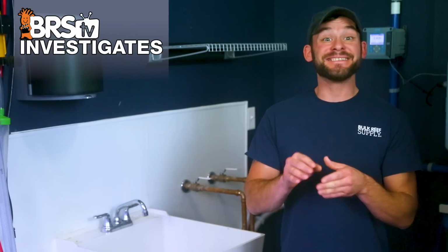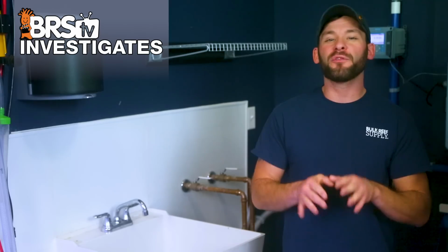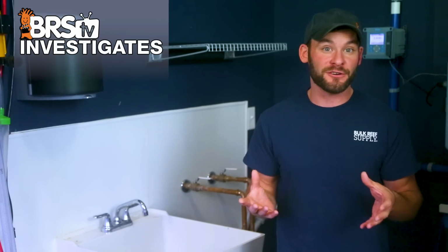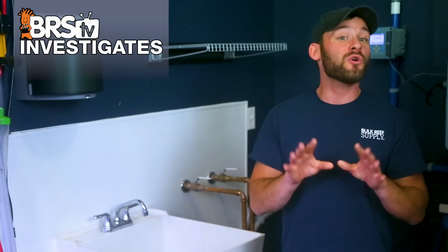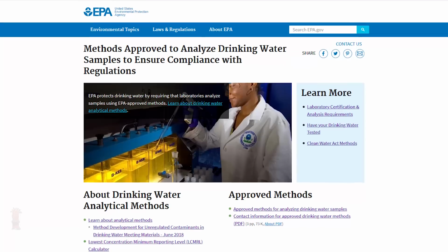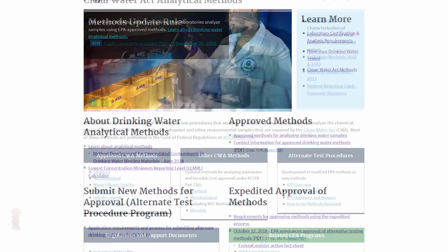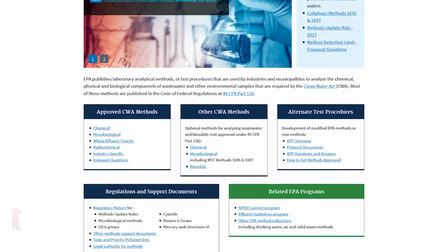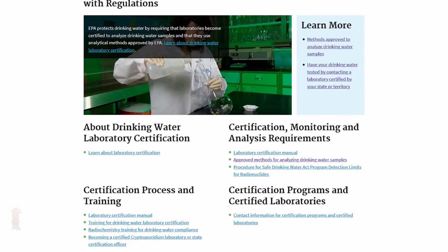Before we get too far into today's results, there are a couple of things we need to keep in mind. The first is that although we can use available ICP analysis testing to provide us with a clearer picture into some of the elements that make up our drinking water, they are definitely not designed, nor should be reasonably interpreted, as the most accurate testing method available. There are entire government agencies in place whose primary role is specifically designed around analyzing the public's drinking water, and if you want to dive even further into the breadth of what those testing methods are, you can absolutely find them on the EPA's website.